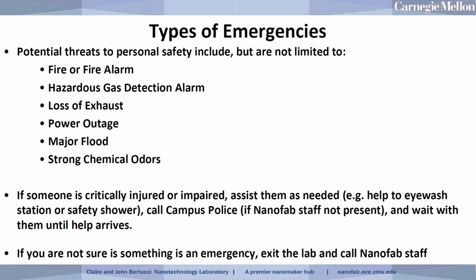Typically, if you're working with chemicals properly and those around you are doing so as well, you can't really detect any of the chemicals that we use in the lab, even those that are highly volatile. So, if you ever do smell something, particularly something that is solventy smelling or sweet smelling, something that burns your nose and throat, or something that makes you feel ill in any way, something that might give you a headache or make you cough or gag, that would be a reason to evacuate the lab.